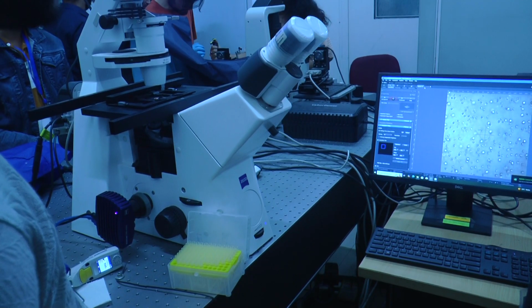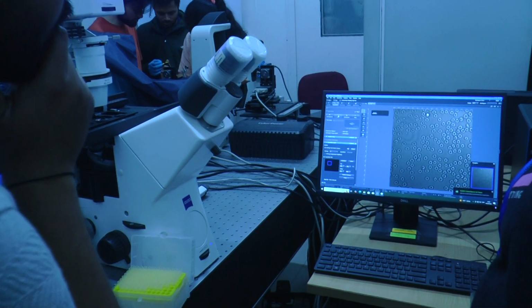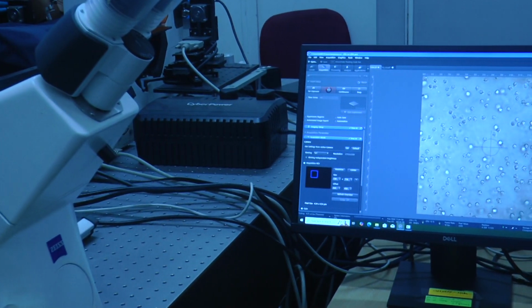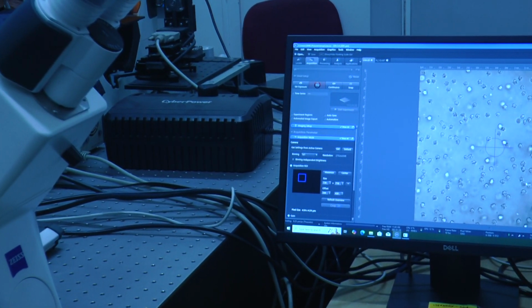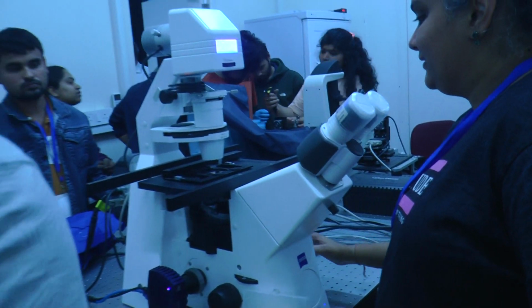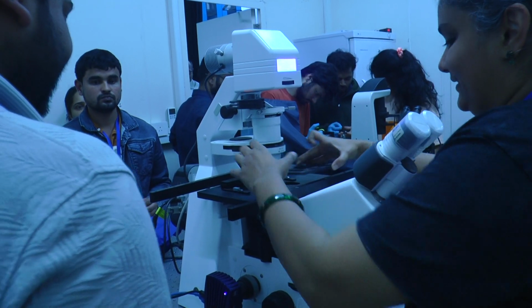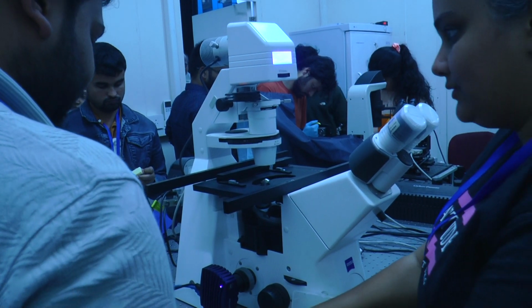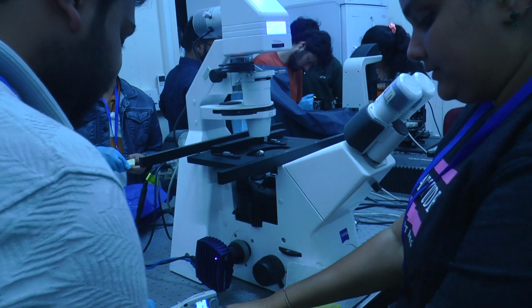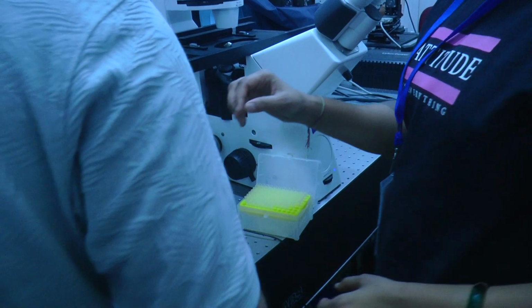Normally it is supposed to look like this, with a certain concentration of red blood cells. But it is less, looking like this. Very less. Yes, the salinity is okay. That's fine. It's very strange. I have always wondered about that. Low concentrations invariably show crenation. 1.2, finally.